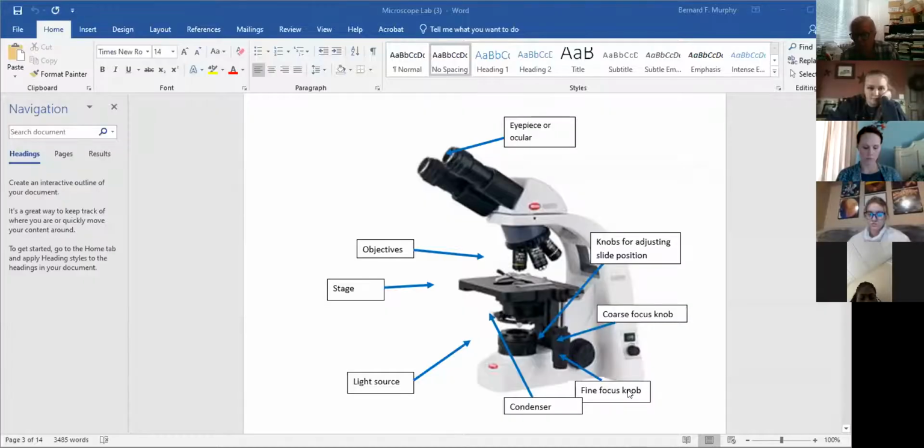What I can show you is, I go back to the other microscope, which has two wheels down here. On that microscope, there are two wheels in the exact same position, but they move the slide holder. They move it forwards and backwards and left to right. This is how you navigate the slide, how you move to look at different areas of the slide.